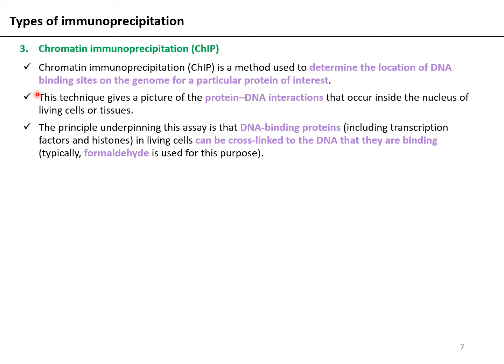So when you treat the samples to prepare them for loading onto the SDS-PAGE, the beta-mercaptoethanol present in the Laemmli buffer will reduce this disulfide bridge, and it will separate out these chemically cross-linked interacting proteins, so that now when you visualize them on either the gel or the Western blot, you can identify the protein on the basis of its size. You will not be observing a full complex, but you can get the individual proteins involved in the interaction on the gel.